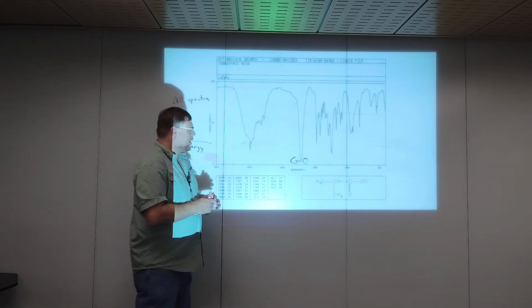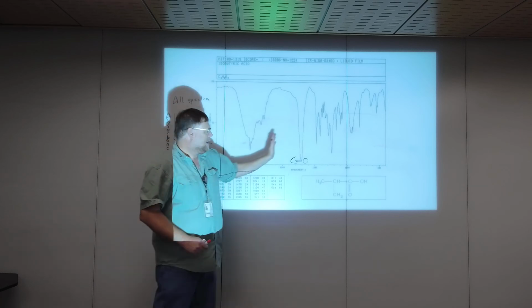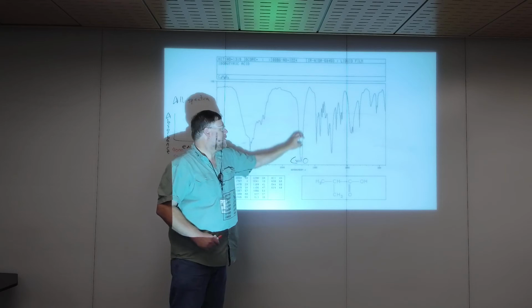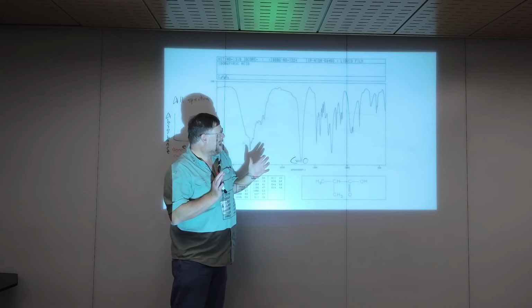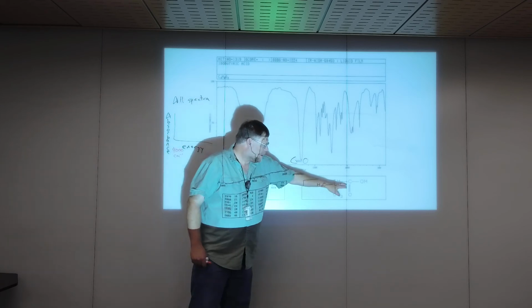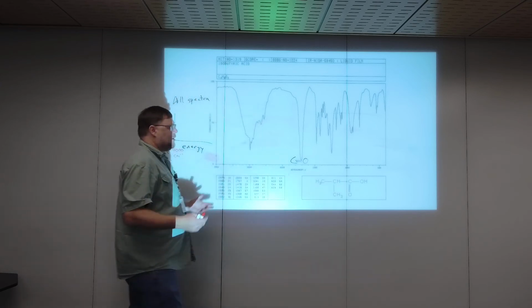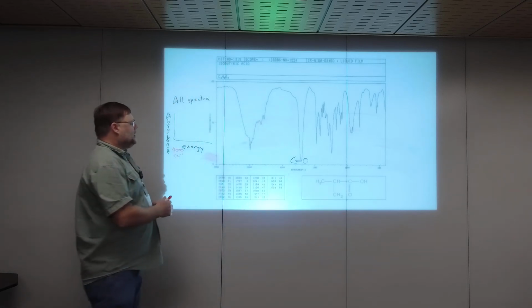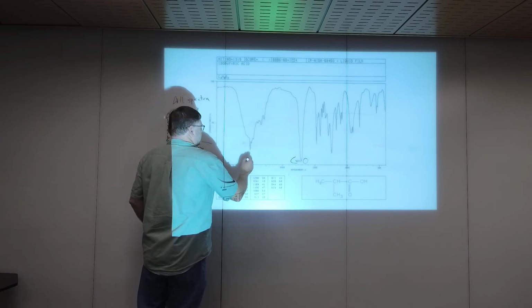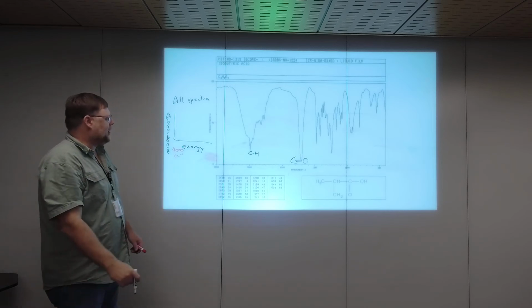Right. The CO double bond is going to be strong, and if you see the entire spectrum, it's going to be basically right in the middle. So if you get this really big, not super broad, but a little broad peak right in the middle, it'll tell you you've got a carbonyl. A CO double bond is a carbonyl, and it's in a variety of functional groups. And then down here we've got a whole bunch of CHs, fairly uninteresting. Organic molecules are going to have CHs.